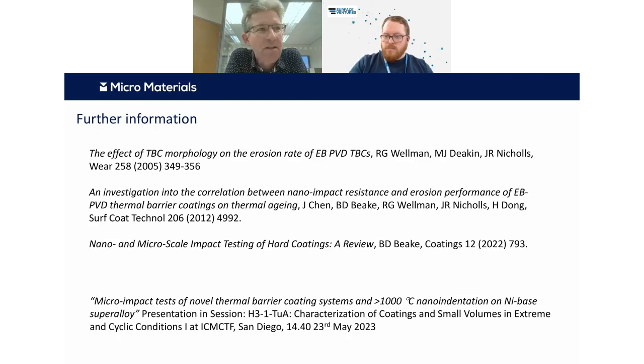I didn't talk about it much, but actually one of the things that we presented was more microscale rather than nanoscale impact wear, because then we could switch towards these 25 micron probes. And they're 25 micron probes made of diamond, and the geometry of these things is remarkably durable. They can handle many thousand impacts without changing their geometry, or potentially even hundreds of thousands of impacts. Whereas if you had a very, very sharp cube corner impact probe, then you might have to be a little bit more cautious.